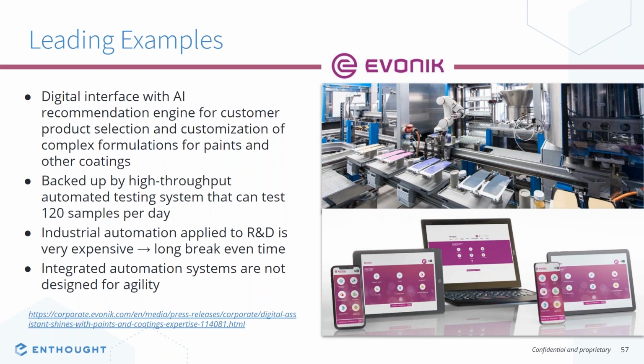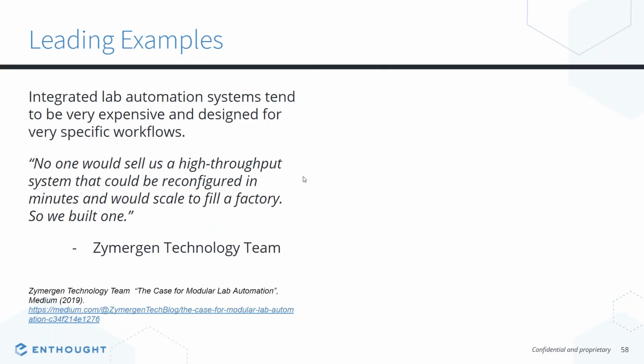Because that industry has a wide variety of well-established industry standards, they've made a long-term investment to buy and develop these systems. But there are other labs where things are much less standardized, or their companies are smaller, and designing a large complex system like this upfront carries a very high financial risk. In these cases, an iterative agile development process that we've talked about here is much more appropriate to mitigate risk and allow you to show development over time and have a faster return on investment throughout the process.